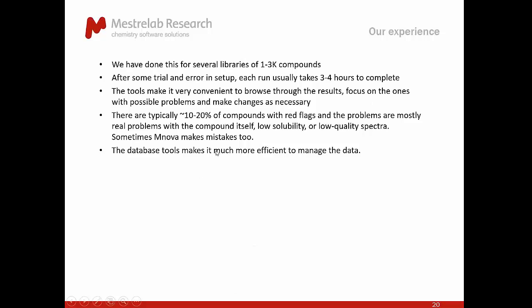Yeah, so a little bit of summary of our experience using this batch verify databasing. We have done this for several libraries of around 1,000 to 3,000 compounds in that range, and usually takes some trial and error to set up the parameters to get a good process template, etc., to hide the residual water peak, etc. And then the run usually takes 3 to 4 hours to complete. We found that the tools we provide make it very convenient to browse through the results, focus on the ones with the possible problems, and make changes as necessary.